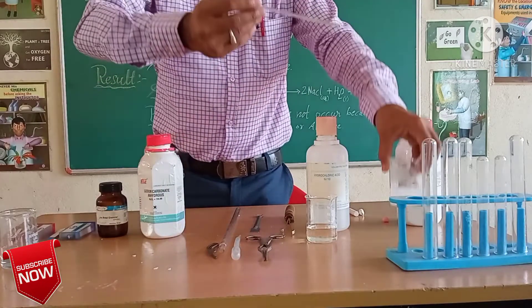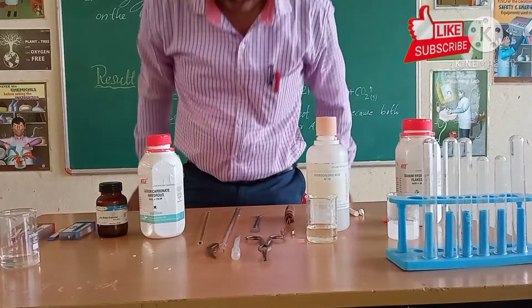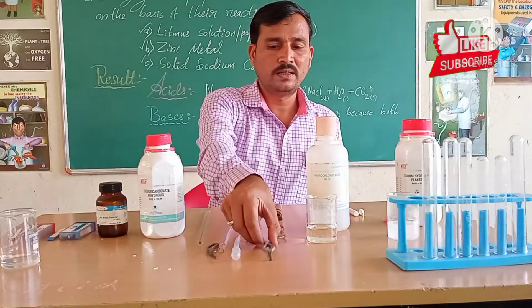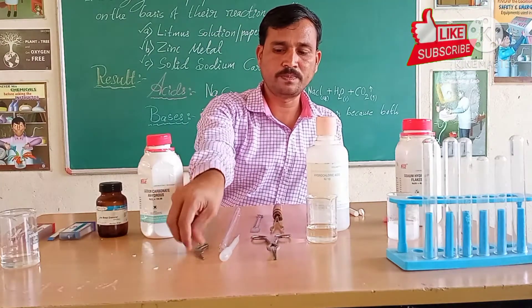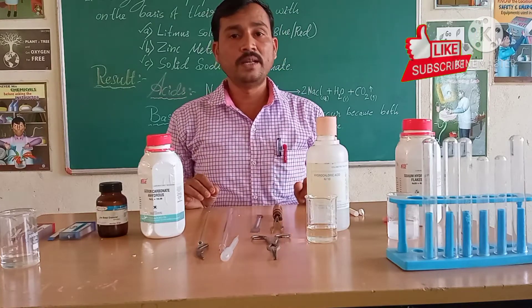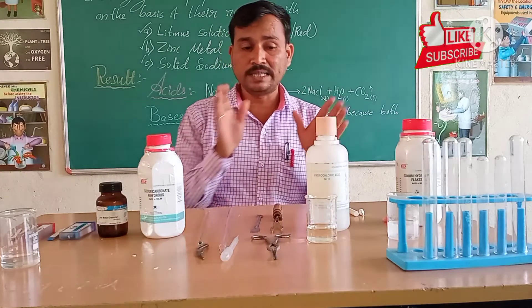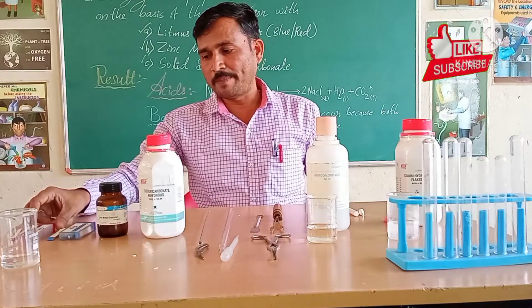Now it is ready. We will take a few minutes. Let me introduce the equipment: this is a test tube holder, this is a test tube stand with test tubes, tongs, dropper, pipette. Now we are testing the property of acid and base with litmus paper.